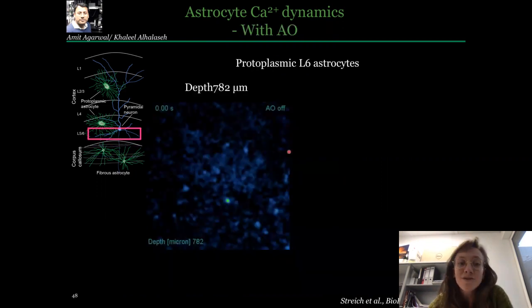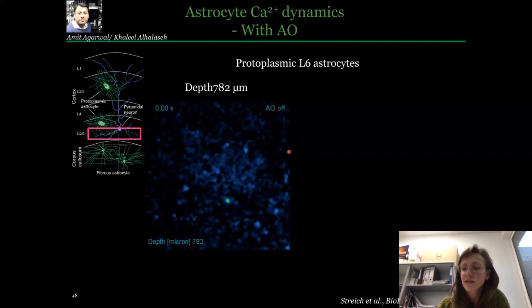But another characteristic of astrocytes, and actually a challenging one for microscopists, is that astrocytes are extremely light and heat sensitive, so they quickly change their physiology upon prolonged light exposure. And additionally, the calcium signals which are of high interest are the synaptic associated ones, so the microdomains, which require high resolution imaging. So implementation of adaptive optics for recording astrocytes is really beneficial in two ways. First of all, it allows you to detect smaller structures. But secondly, correcting for aberrations and recovering efficient signal excitation allows you also to reduce the excitation power and therefore maintain more physiological imaging conditions for the astrocytes.